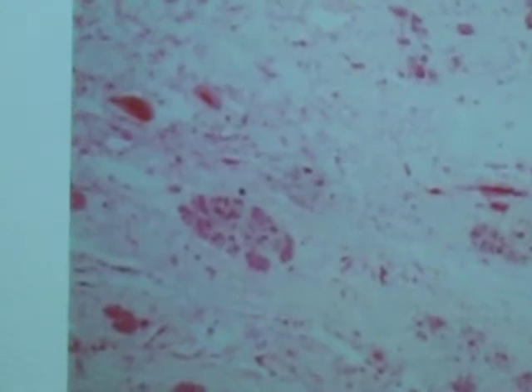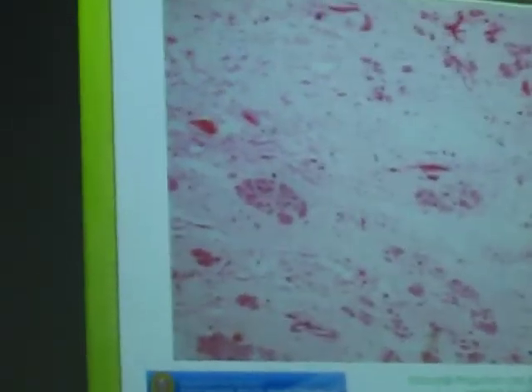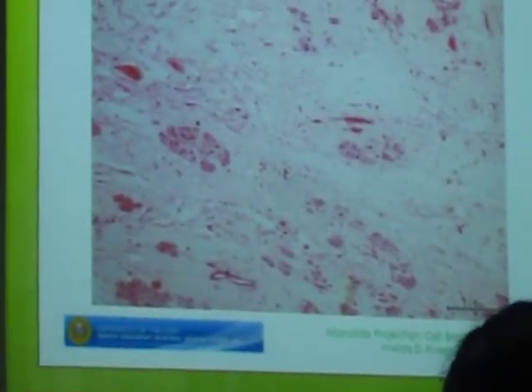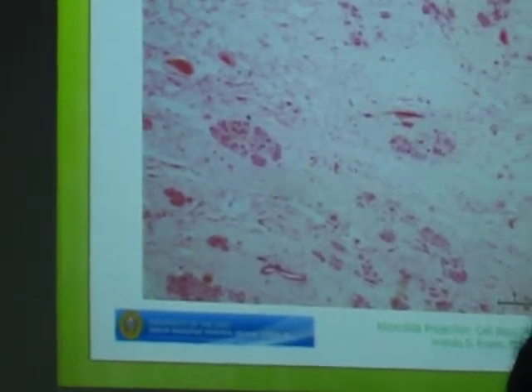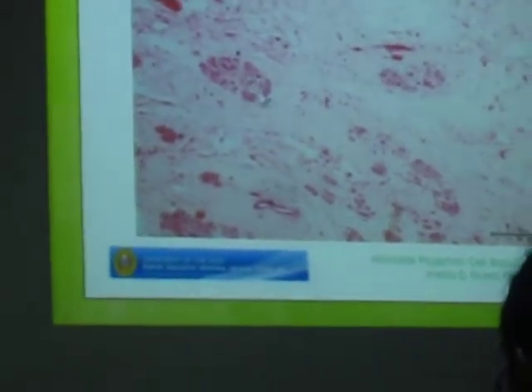Identify whole tissue. Be specific. It's one of the demo slides in the laboratory. This is the inactive mammary gland. You have the connective tissue and the lobules.